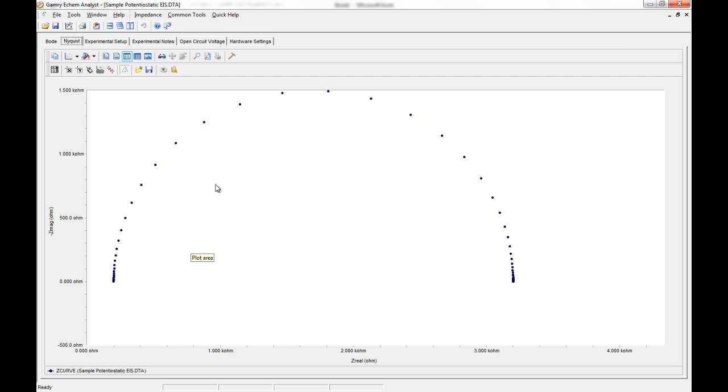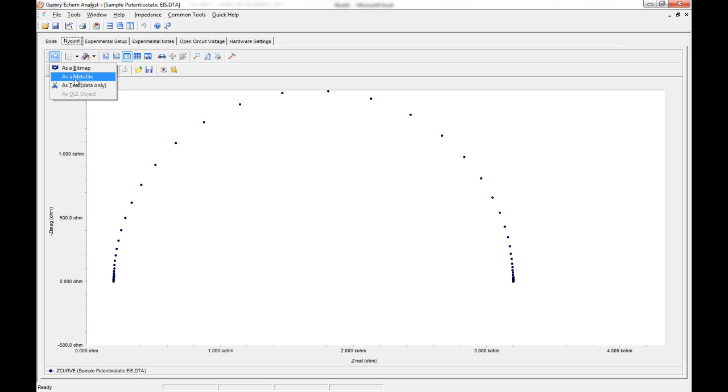Another neat feature of Ecamm Analyst is that you can export as bitmaps or as meta files. So perhaps you want to paste right from here into PowerPoint or Word for publication purposes.